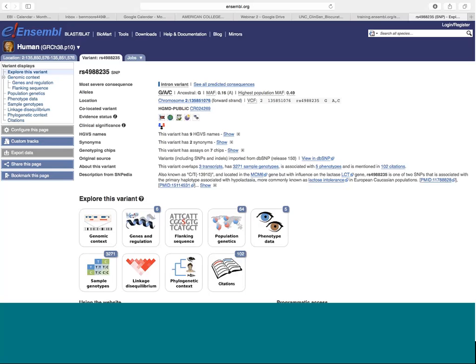You can find out other information about the variant as well, like its location. You can find out some information about its HGVS nomenclature, which I think you might be interested in using in your analyses. HGVS obviously indicates perhaps sometimes the protein and transcript effects as well.